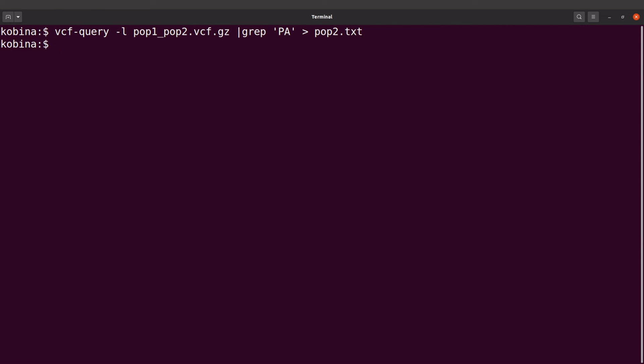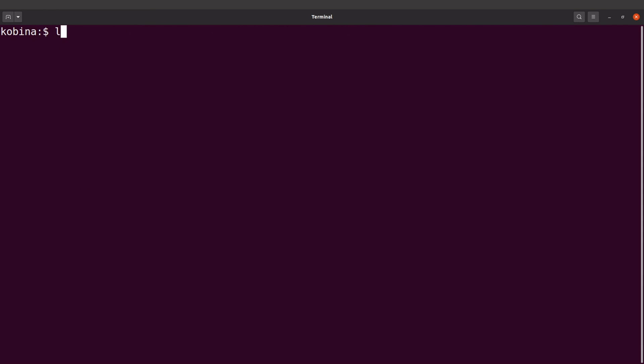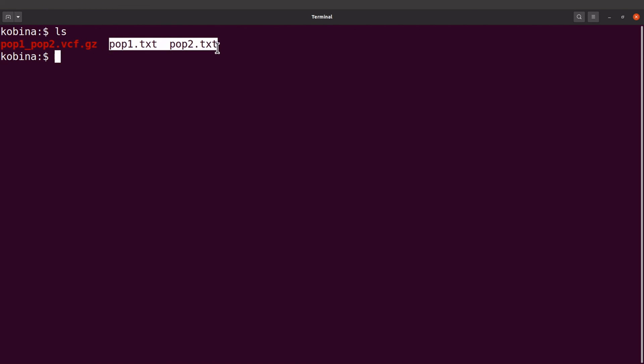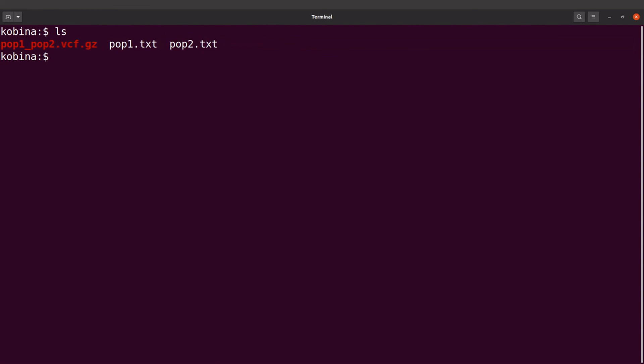Okay so that's for pop two. I'll use the head command to display, let's say the first few lines here. Okay so that's for PA. Okay so now we have both files ready. Let's check them again, so let's do an ls here and then you'll see these two files. So this is pop one, this is pop two.